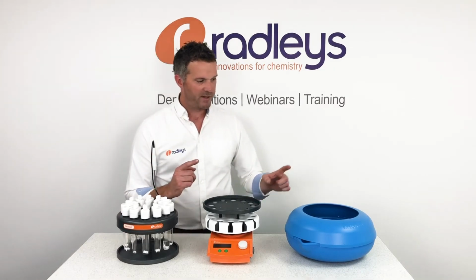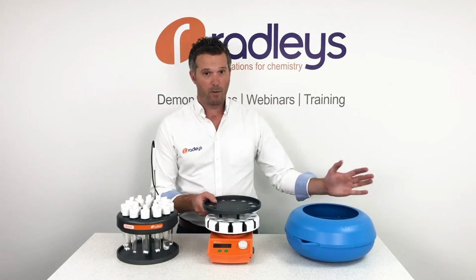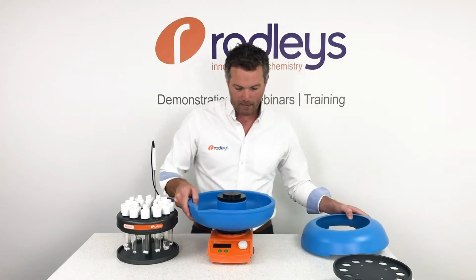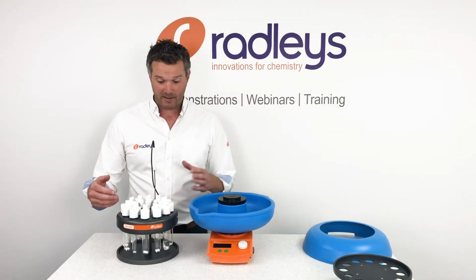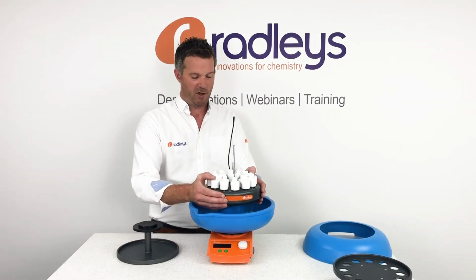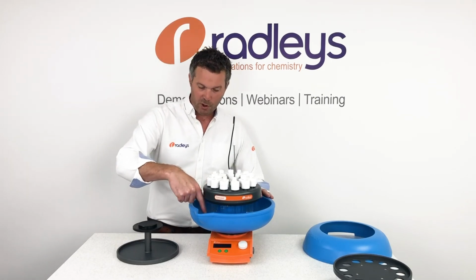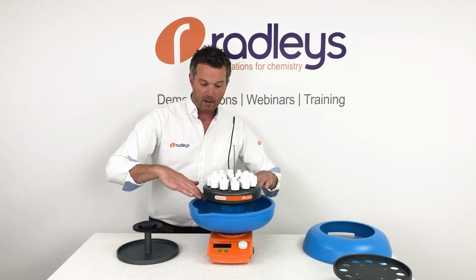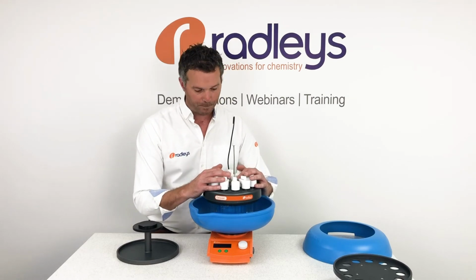If, however, you actually wanted to do a cold reaction, you'd use the Carousel 12 cooling reservoir. So this sits on top of the hot plate, and you can load this up with dry ice and acetone, so temperatures down to -78, but of course you can use other solvent mixtures for different temperatures. And this will hold the tubes in that nice magnetic stirring position, so you'll have stirring, cooling from your ice bath, and still the inert gas connection at the top.